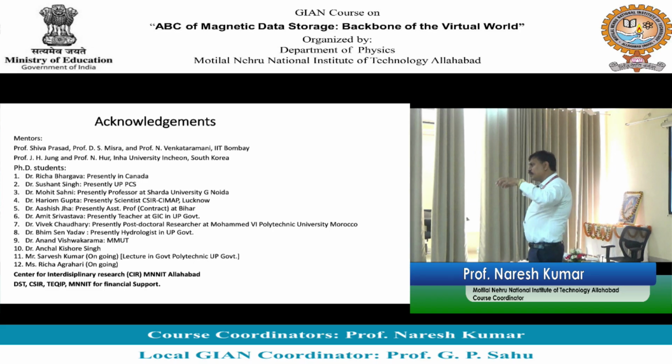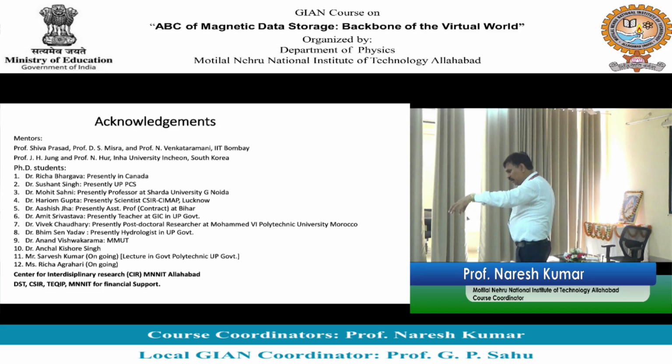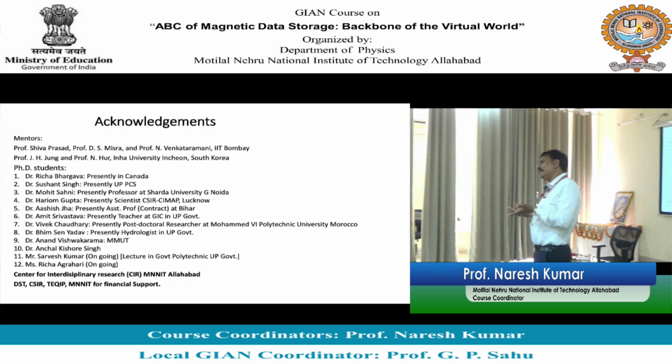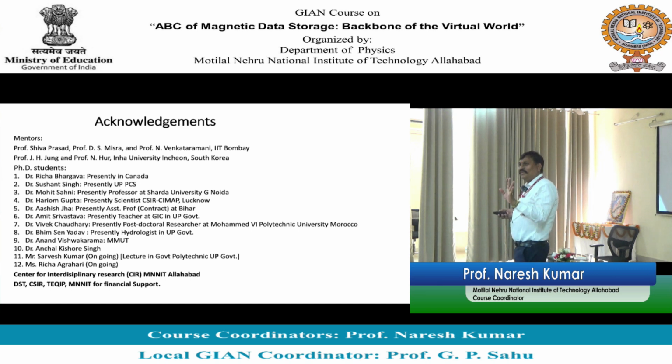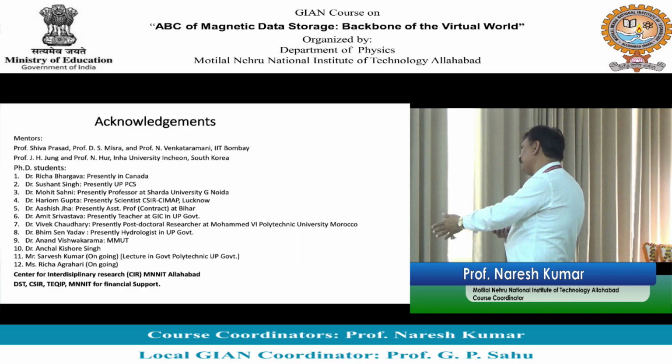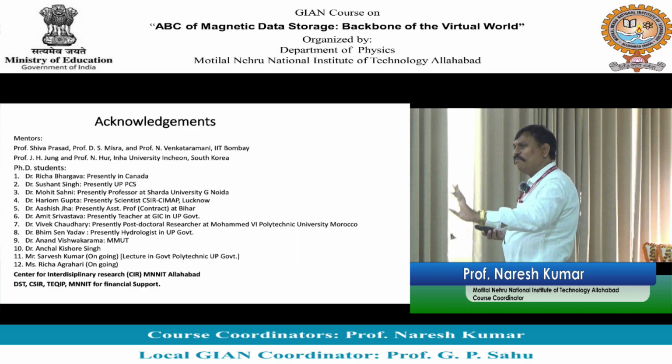Yes, because at that particle you take the electron beam and check the diffraction pattern. So that way you can easily find out. So TEM is the best way to tell you the particle size. Yes, and TEM is also like X-ray diffraction. Same. जो है वही Bragg's condition है. सेम, it's the same Bragg's condition.